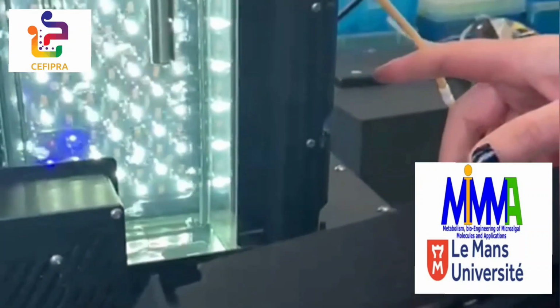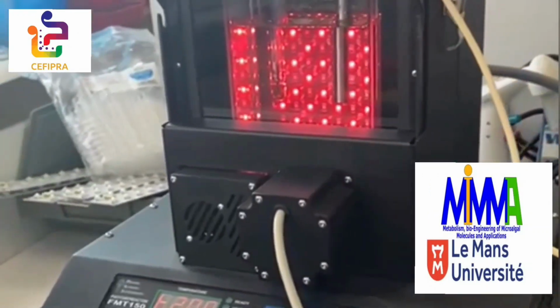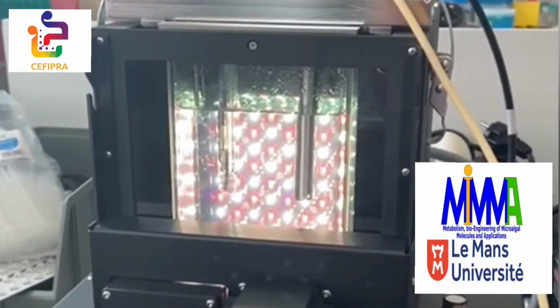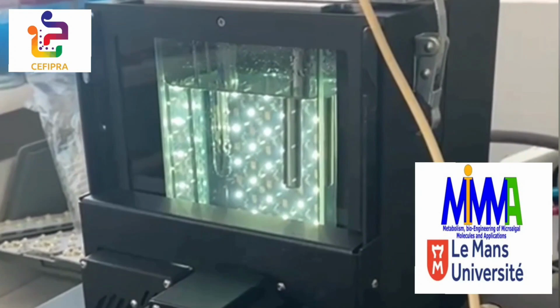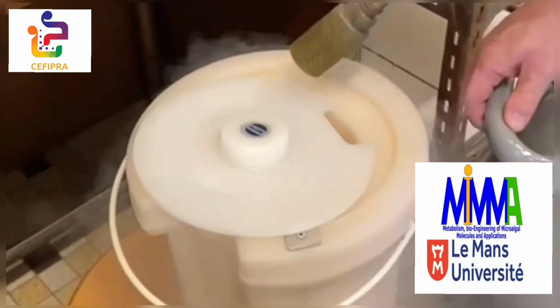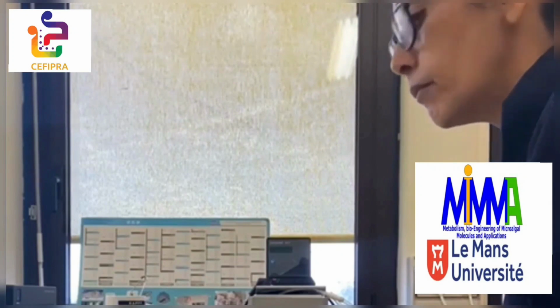Stirring, magnetic stirrer. And here you have the equipment that is used to make different physiological measures, like Fv, Fm. You have to fill it up several times. It will evaporate. Then you see it's just cooling down. This system is not that complex.